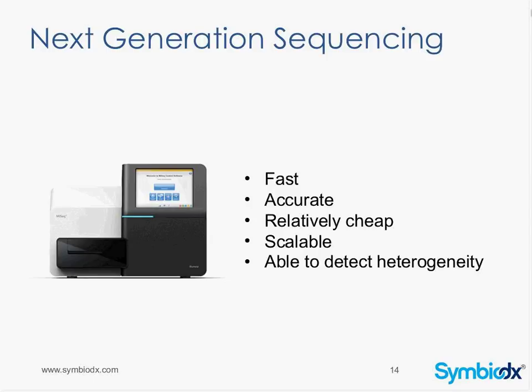The technology that came out is what we're going to talk about today, and this is called next-generation sequencing. So we know intuitively that this is really important. We hear it talked about a lot, but what are the specific differences? Well, compared to traditional Sanger sequencing using that traditional capillary electrophoresis machine, next-generation sequencing is fast, it's more accurate, it's relatively cheap, and it's scalable.